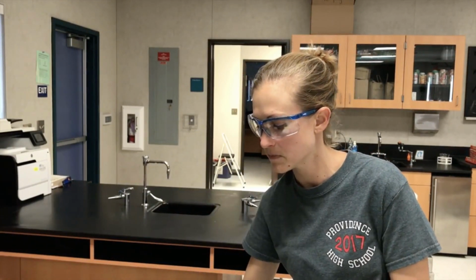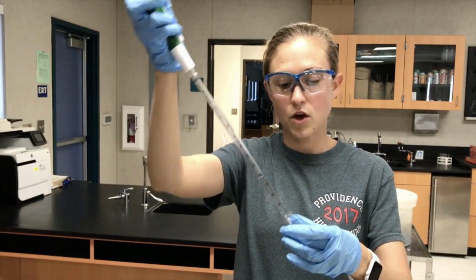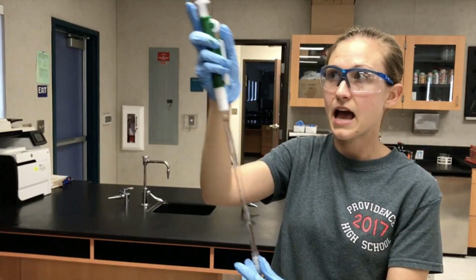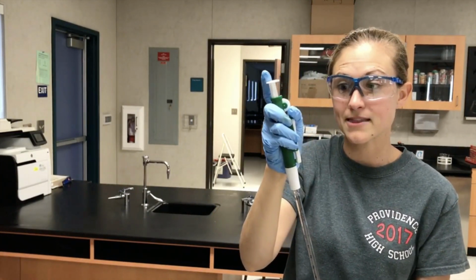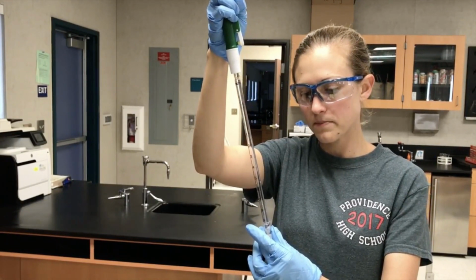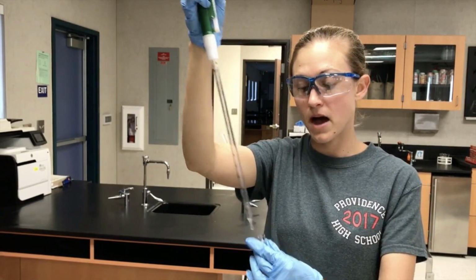I put my water down. I'm going to put it over the opening of my cuvette, and then I'm going to hit this button right here, which allows me to release. I can also just push this button here, and that will also release it. So I'm going to push the button. Okay. Now I've got 4 mLs of water in my cuvette.